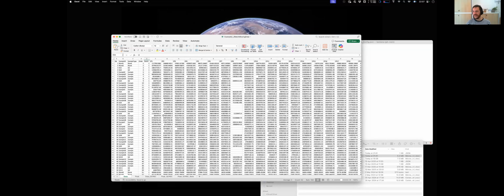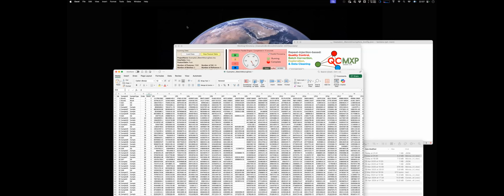Yeah. So I still have 1 question, but maybe Rafael wants to ask a quick one. Yeah, can you explain a little about the blank ratio? I'm not so sure about the 20%, 30%, how it works.